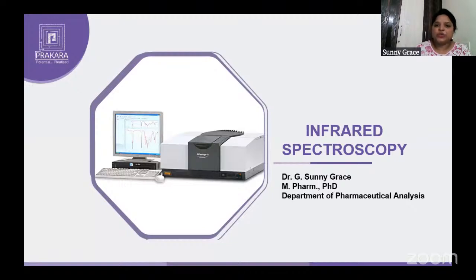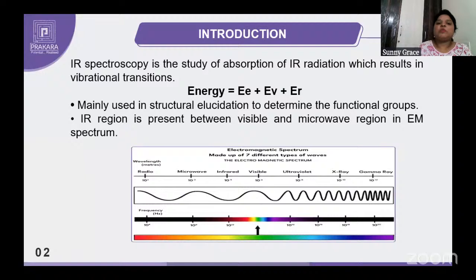Now let's get into the introduction of the topic. So coming to the introduction, IR spectroscopy. What is IR spectroscopy? IR stands for infrared. Spectroscopy is the study of the interaction of electromagnetic radiations with matter.